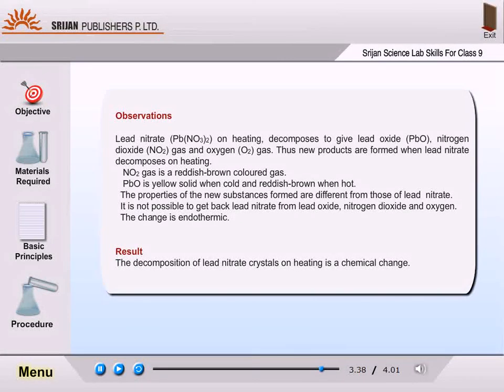It is not possible to get back lead nitrate from the lead oxide, nitrogen dioxide, and oxygen. The change is endothermic.